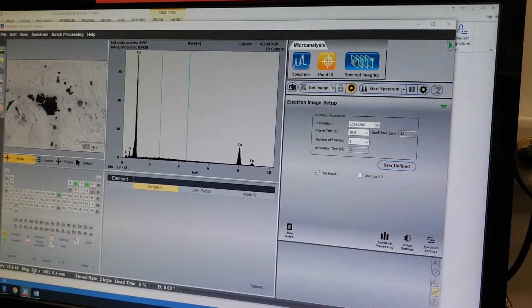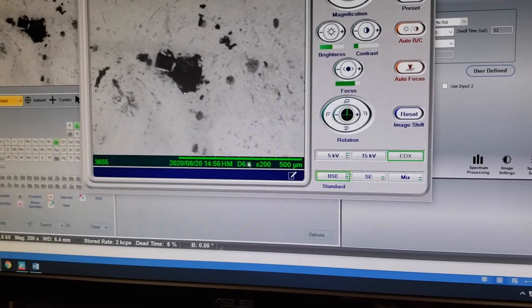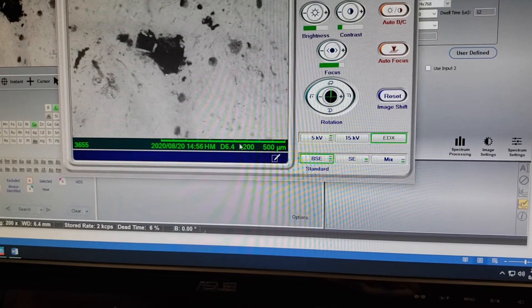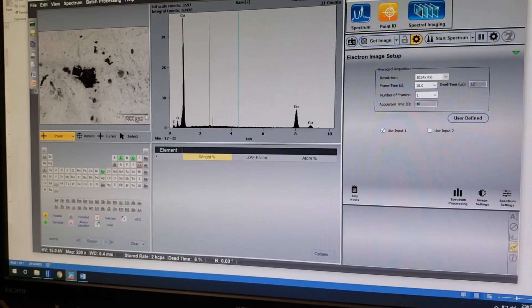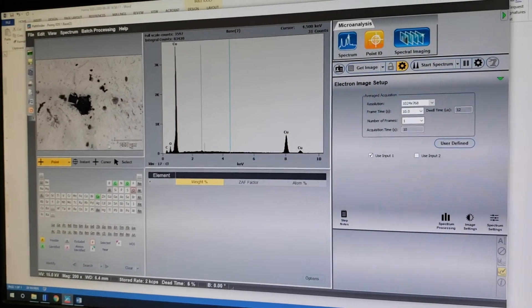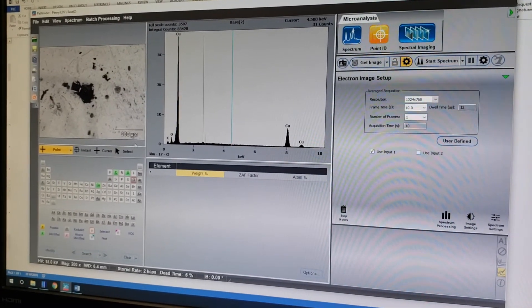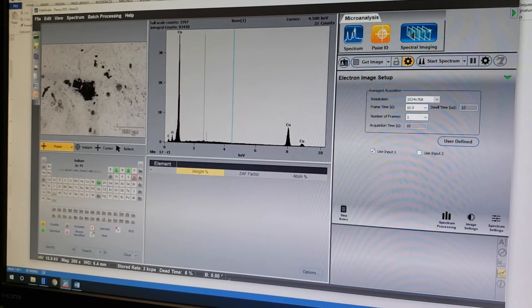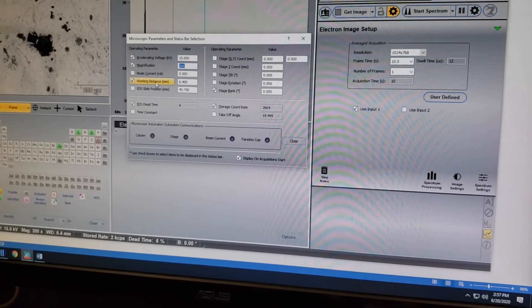You also want to make sure magnification and working distance values are correct. Working distance is found here and magnification is found here. If those are not correct, the scale bar on your image will be incorrect — which could be confusing if you're sending this to your boss. To change them, click on either one, which brings up the dialog box where you can update the magnification and working distance.